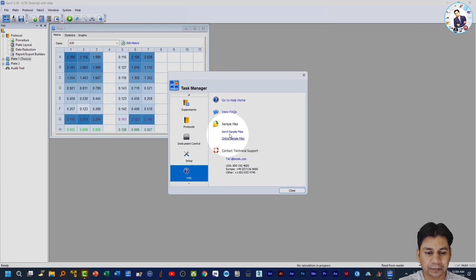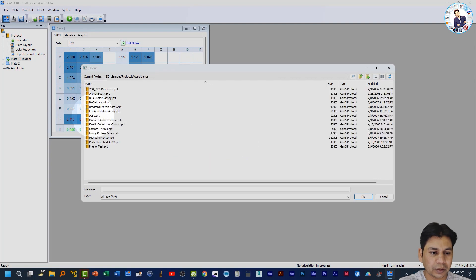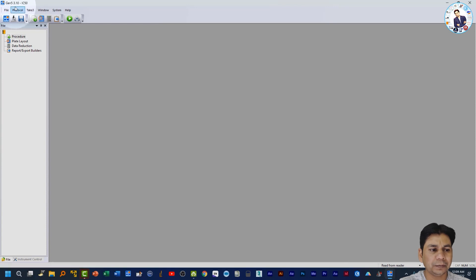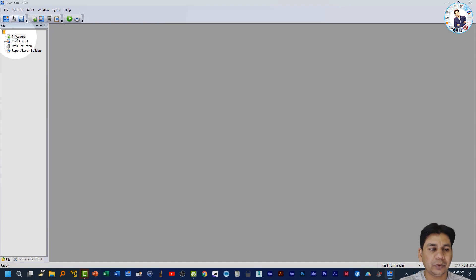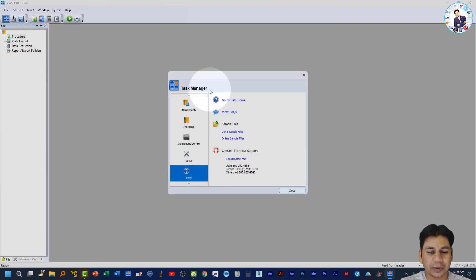Now if you open the protocol file — I'm going to open the Gen 5 sample file from here, selecting the Protocol > Absorbance > IC50.prt, which means it is a protocol file. You can see that this IC50 protocol file has no plate attached to it. That is the major difference between the experiment and protocol.